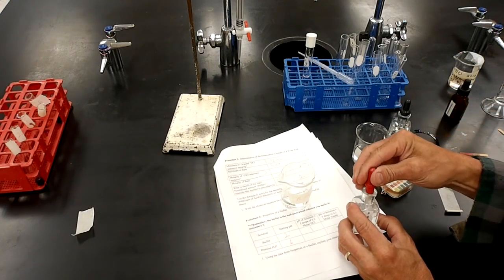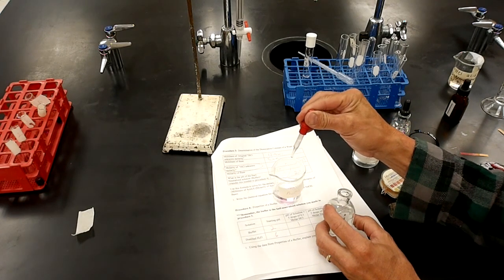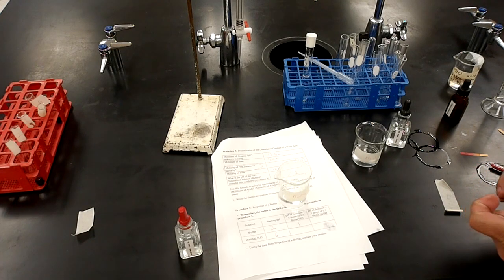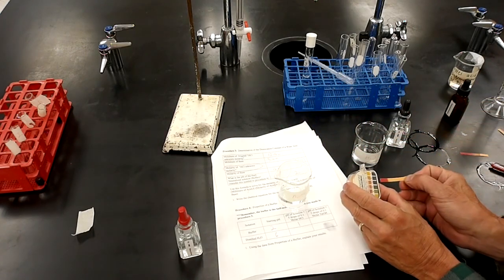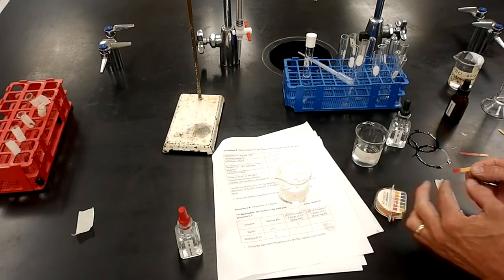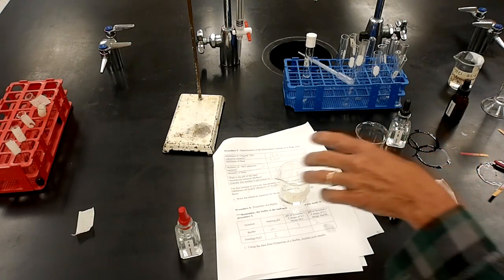And I'll add 5 drops of sodium hydroxide. 1, 2, 3, 4, 5. And maybe a pH of 2. It's hard to tell. Those colors are pretty close for my old eyes. All right, that's the buffer.